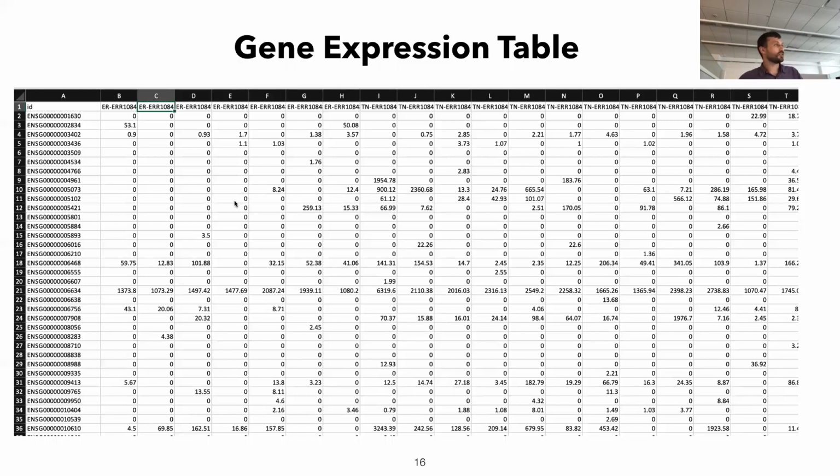Okay, so as a result, you will get something like this. You can see here ENSG, again, is the gene ID. And what are these now? How is this different from the cell line data that we were looking at? Who can tell me?